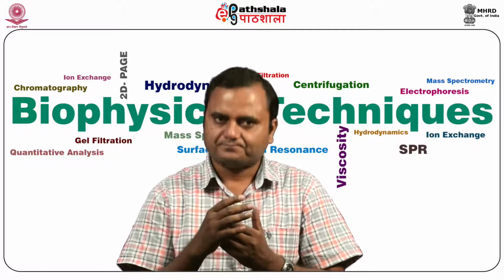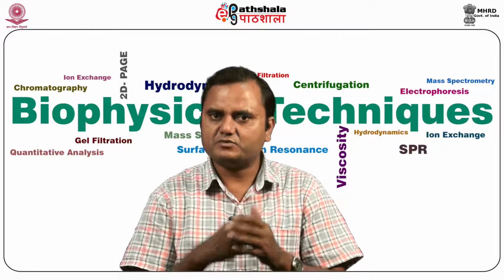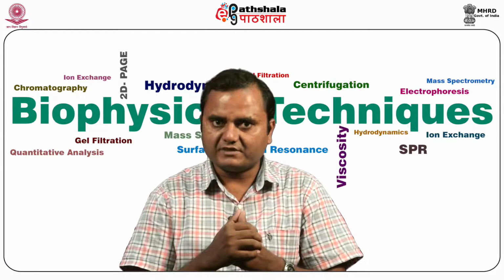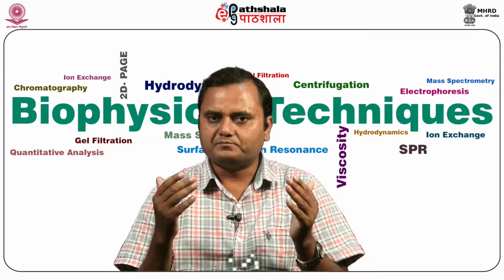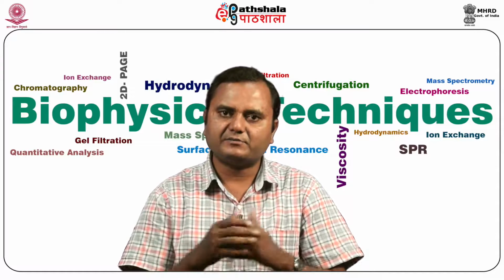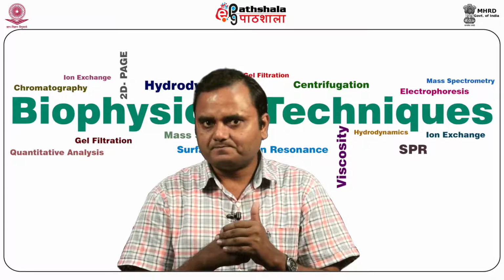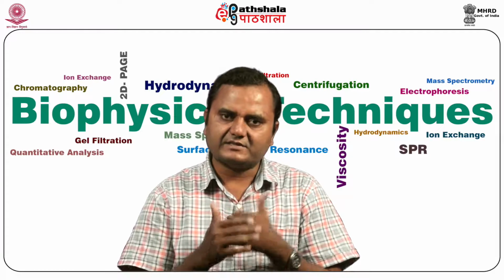So before that I will give the idea that it is precisely used for the determination of the sedimentation coefficient, which actually measures the size of the particle, molecular weight of the molecule, molecular shape of the molecule, and molecular interactions such as protein-protein interaction, protein-ligand interaction, protein-DNA interaction. All kinds of interactions can also be measured using the ultracentrifuge. So it actually works at very high speed or RCF. That is the main advanced feature.